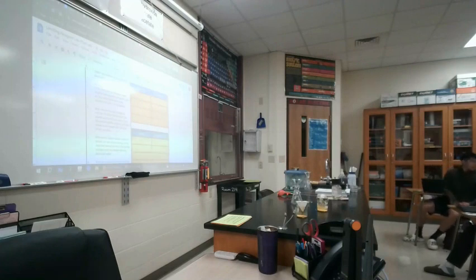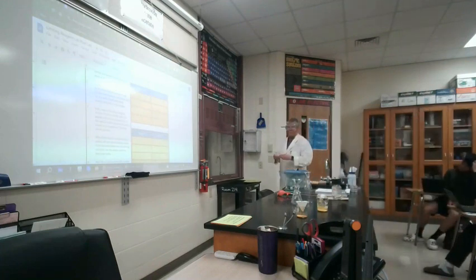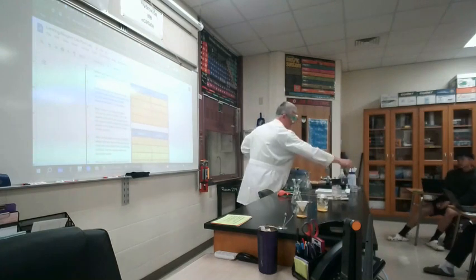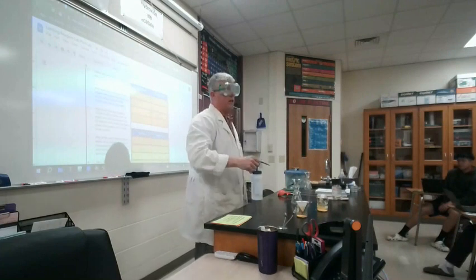You grab one, and after you have it masked, you fold it in half twice. Once in half, twice in half. You take your water bottle, only using deionized water. Now, you wonder why we use deionized water, ladies and gentlemen?